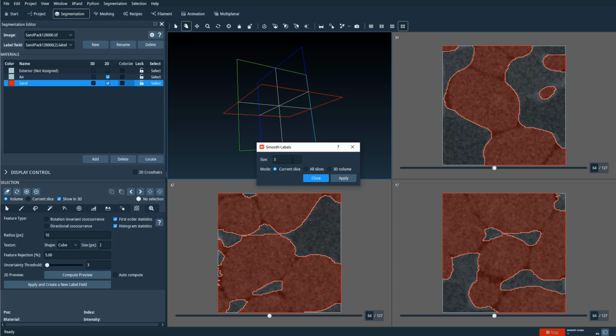And let's say I want to apply the smoothing. As the name implies, the smoothing smooths out the segmentation. So let's click apply, and you can see the jagged regions got reduced. So this makes your segmentation smoother. And basically, we can do this again to keep smoothing the data or increase the smoothing neighborhood. Okay, so let's say for now I'm okay with this.